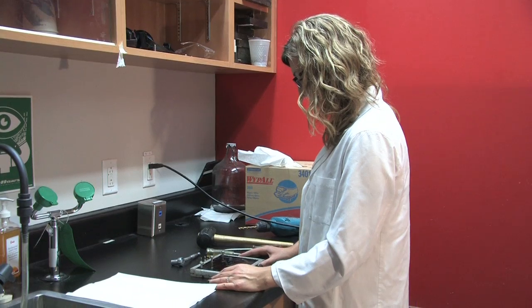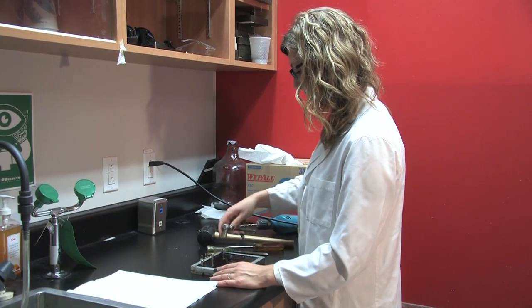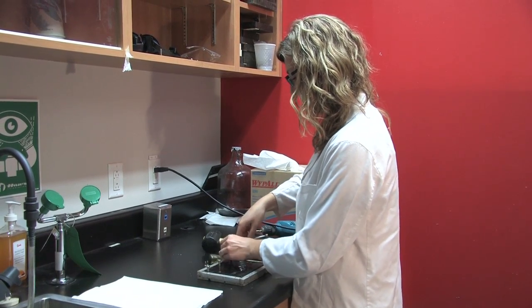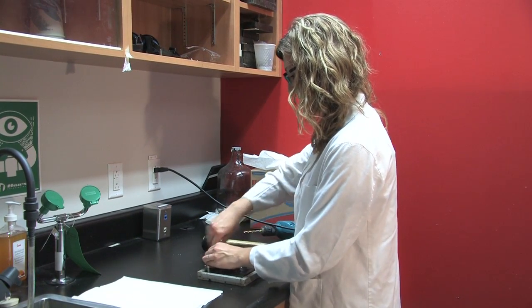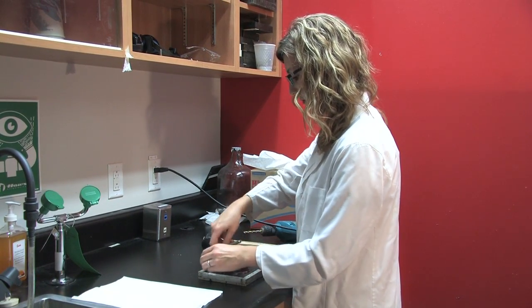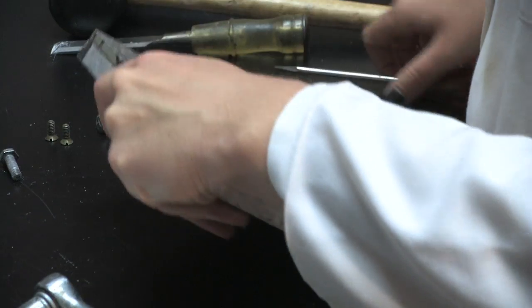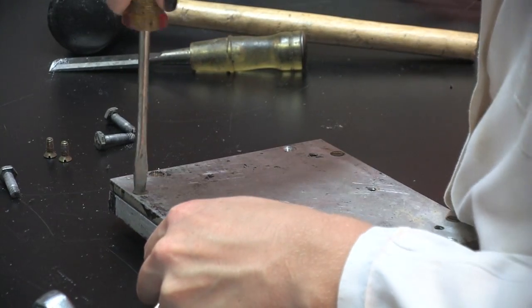Once the plates have hardened for 24 hours in a fume hood, they can be removed from the trays. You can start by undoing the bolts at the top of the trays. And you'll probably have to remove one of the sides of the trays as well. This is done by removing the screws on the bottom of the plate.